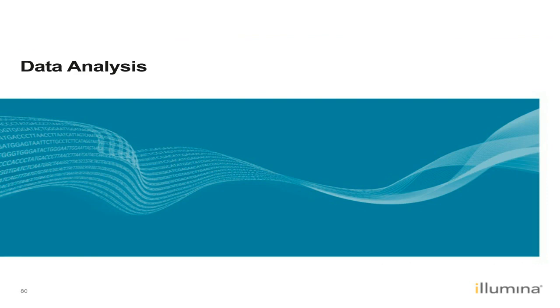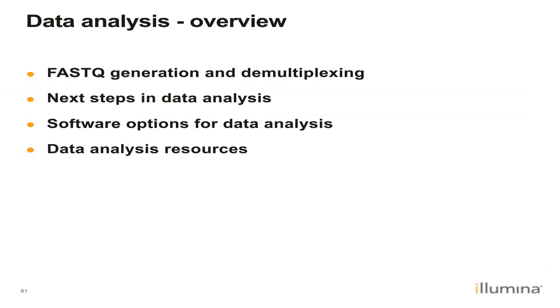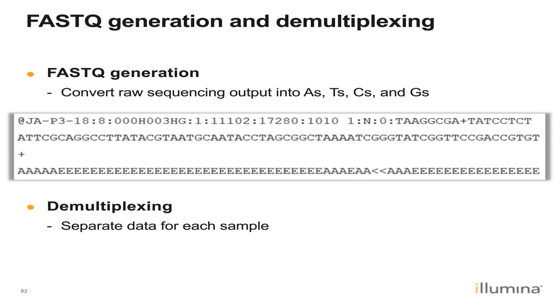Once the sequencing run completes, we can move on to data analysis. Here, we will discuss FASTQ generation and demultiplexing, next steps in data analysis, software options for data analysis, and data analysis resources. Our first steps are FASTQ generation and demultiplexing.